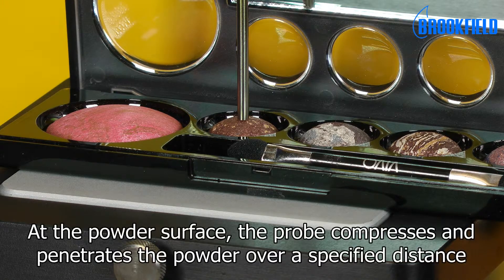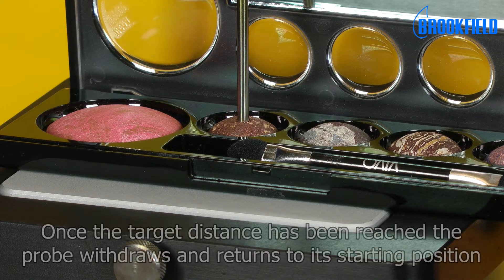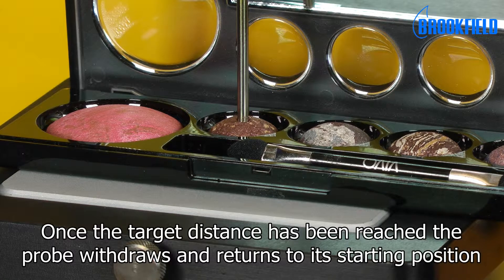At the powder surface, the probe compresses and penetrates the powder over a specified distance. Once the target distance has been reached, the probe withdraws and returns to its starting position.